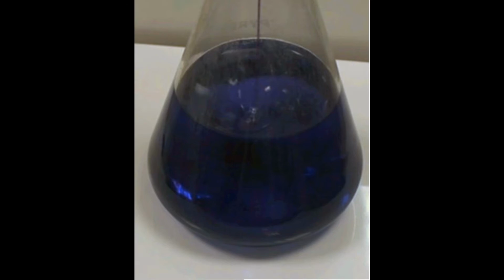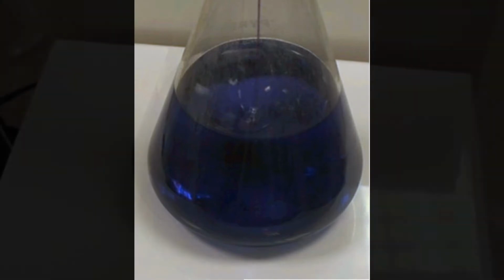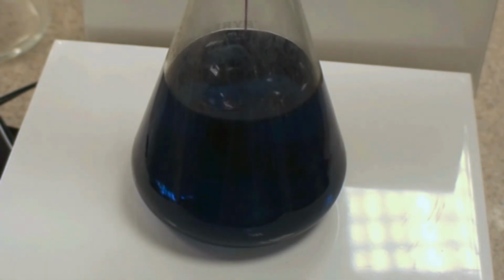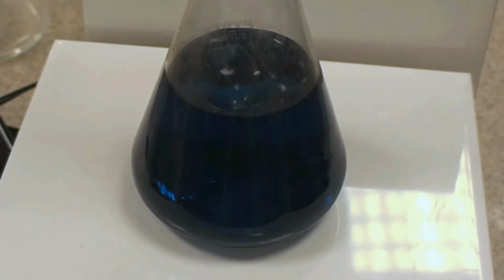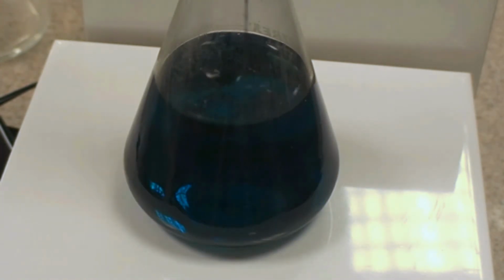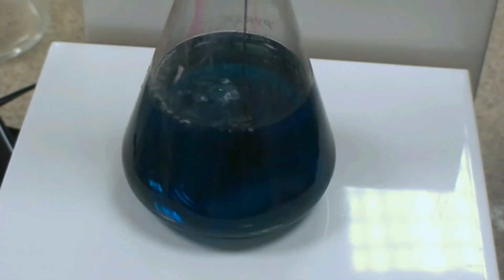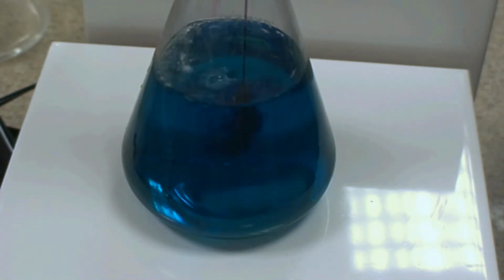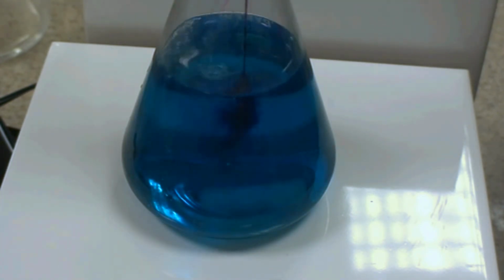Potassium manganate 7, potassium permanganate, a powerful oxidizing agent, is steadily added to oxidize the vanadium compound. From violet, the solution goes through various blues to the bluey green of vanadium 3, then continues to the clear blue of vanadium 4, before finishing off back at the yellow 5+ again.